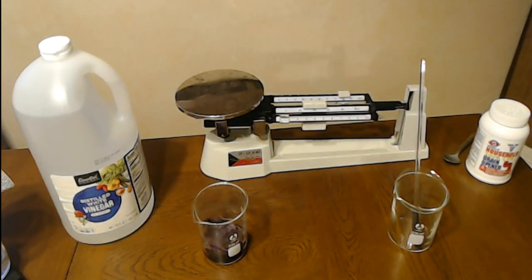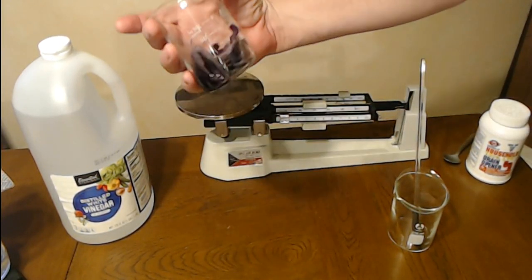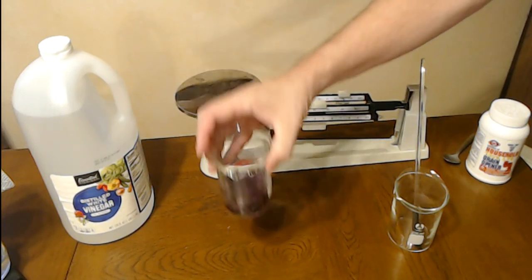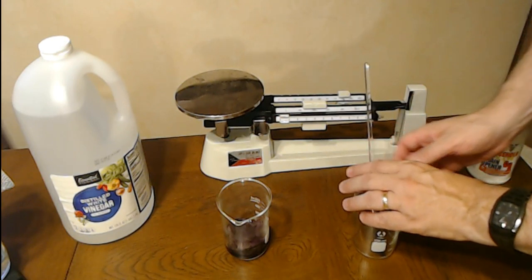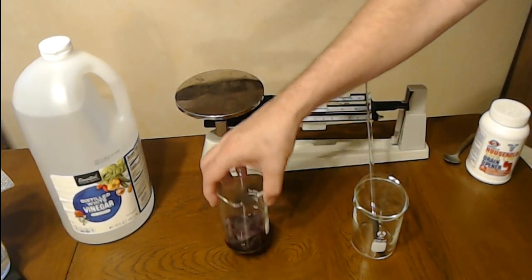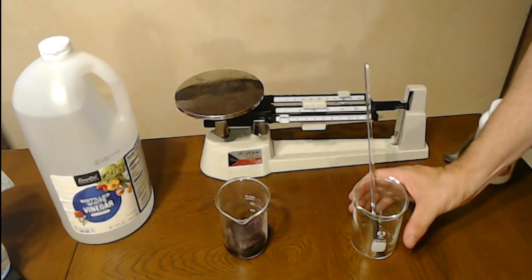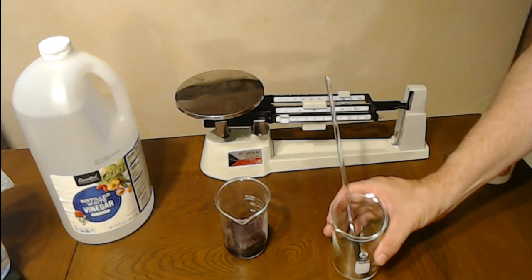Okay, so what we need is, I boiled some red cabbage in distilled water. Distilled water is pH neutral, pH is 7. So neither acid or base, although that's a lie because you'll learn later in the class that water can be an acid or a base. So then I have an apparatus we're going to use. This is also washed and rinsed in distilled water.